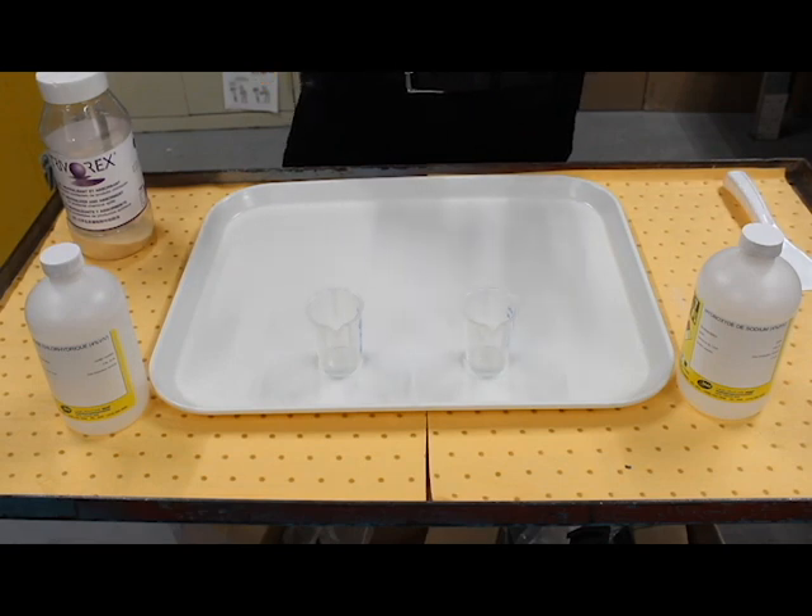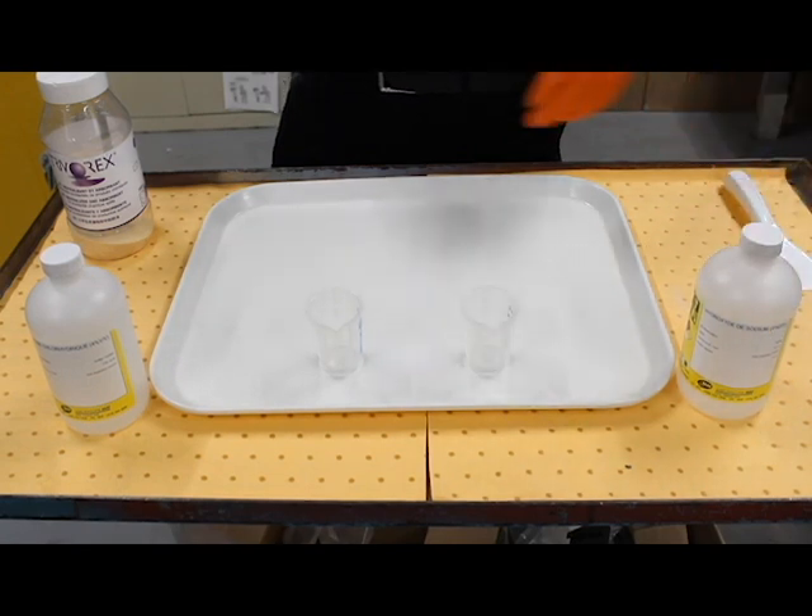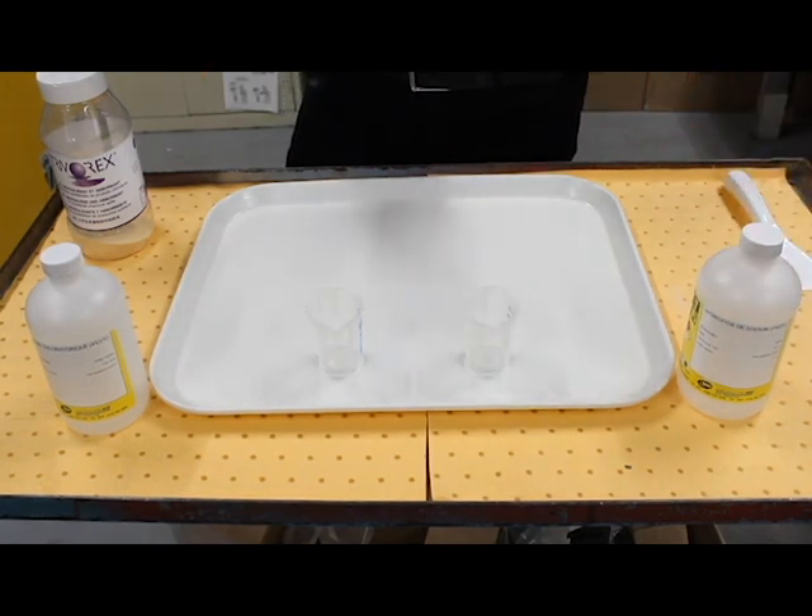We have two chemical spills here. One's an acid, one's a base. I've got a 4% concentrated sodium hydroxide and a 4% concentrated hydrochloric acid.